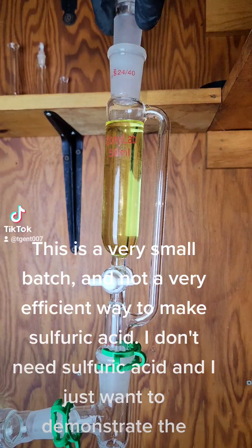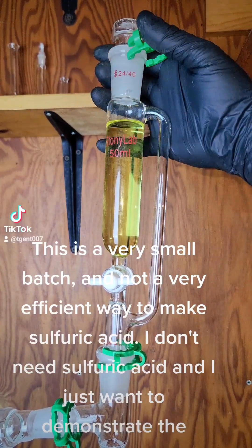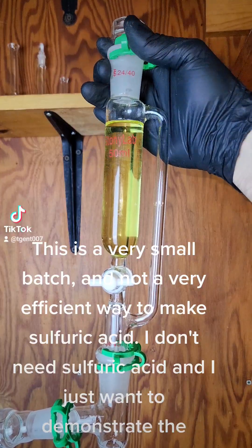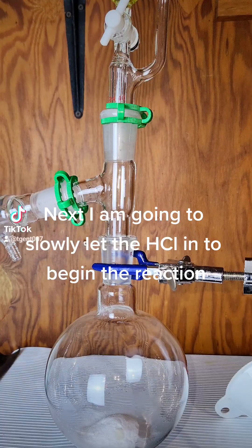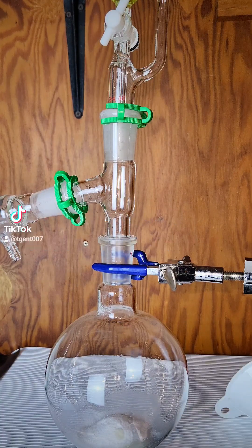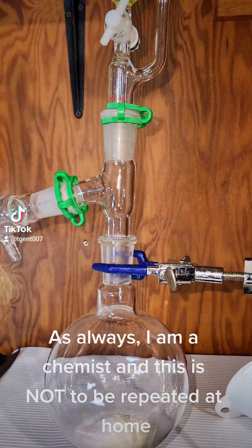This is a very small batch and not a very efficient way to make sulfuric acid. I don't need sulfuric acid — I just want to demonstrate the process. Next I am going to slowly let the HCl in to begin the reaction. As always, I am a chemist, and this is not to be repeated at home.